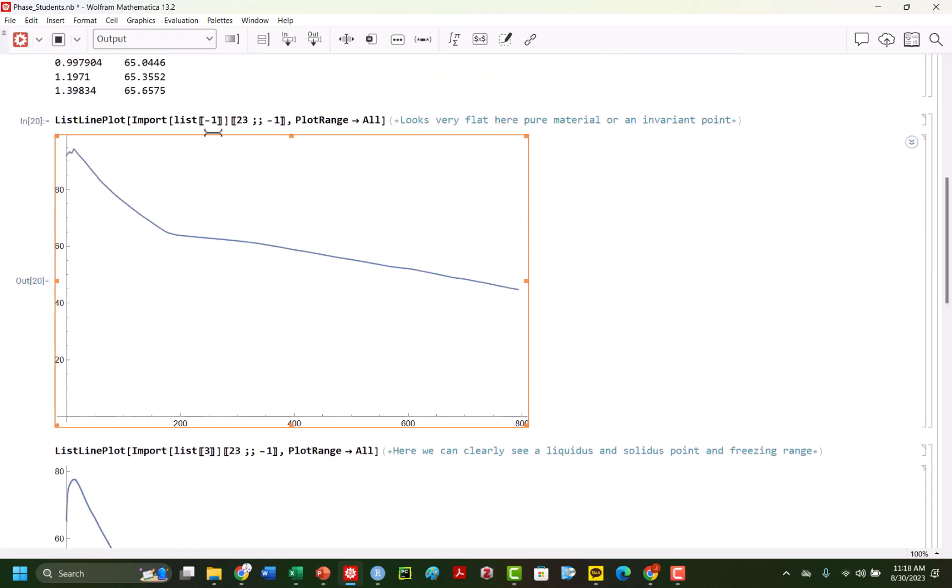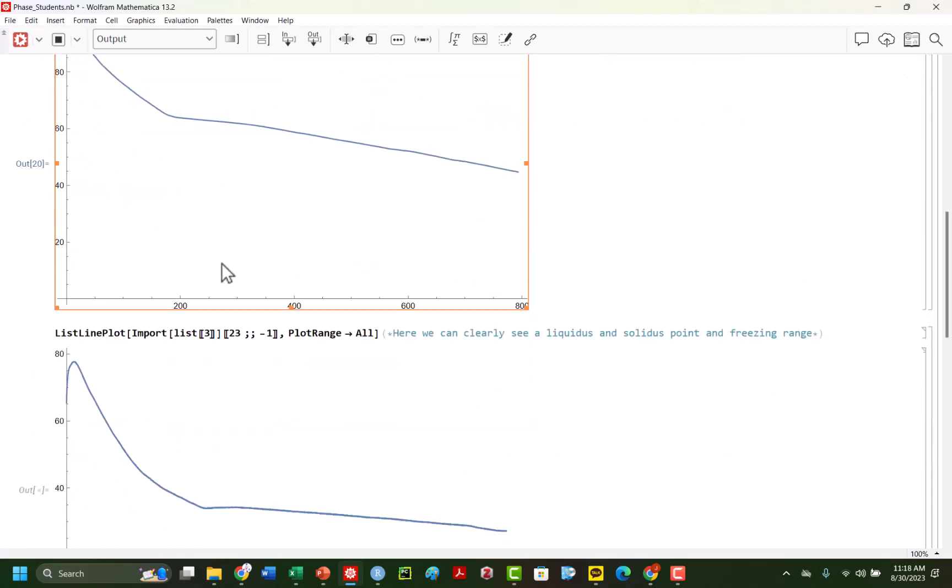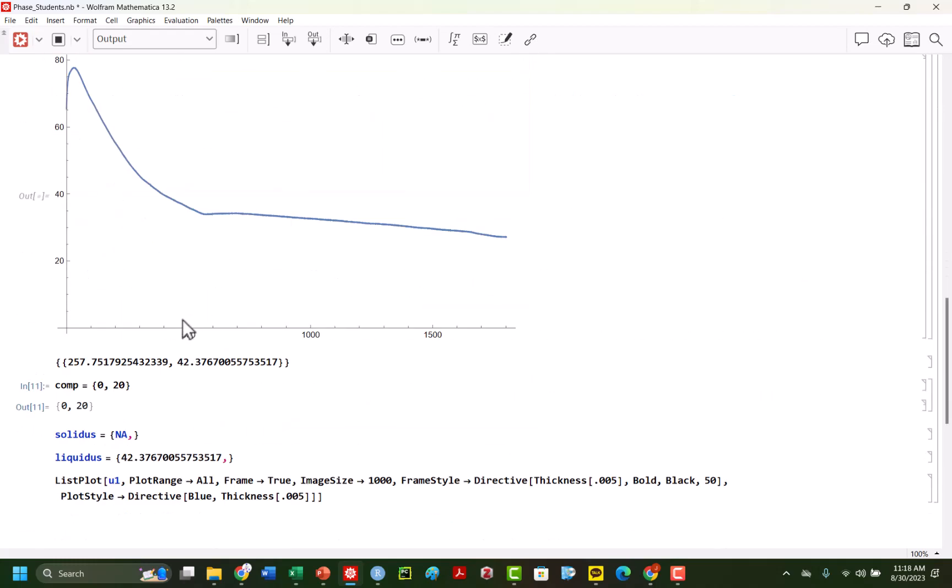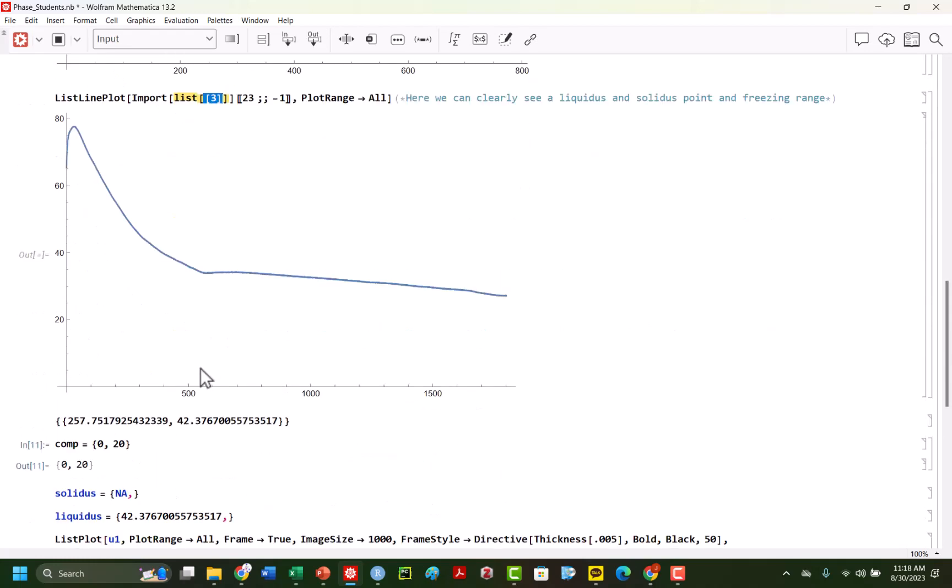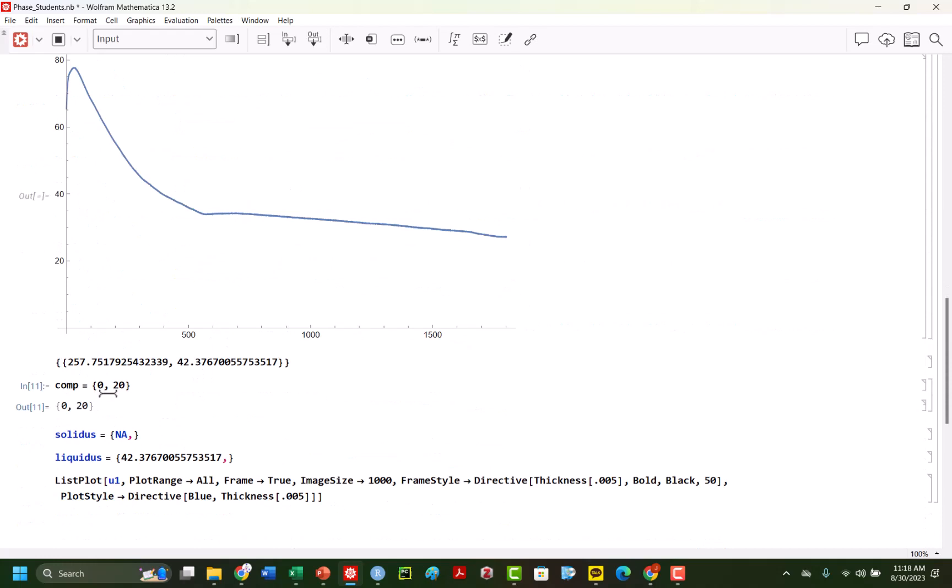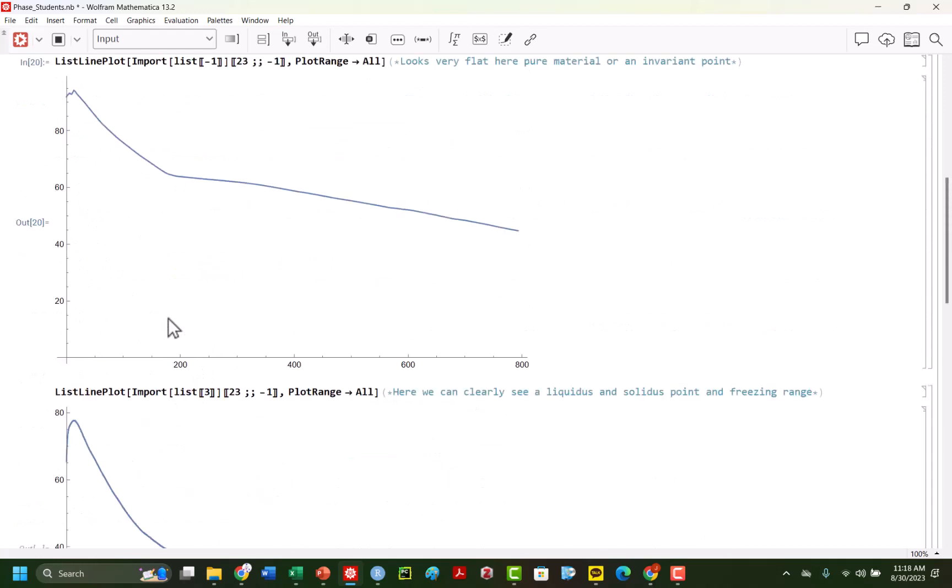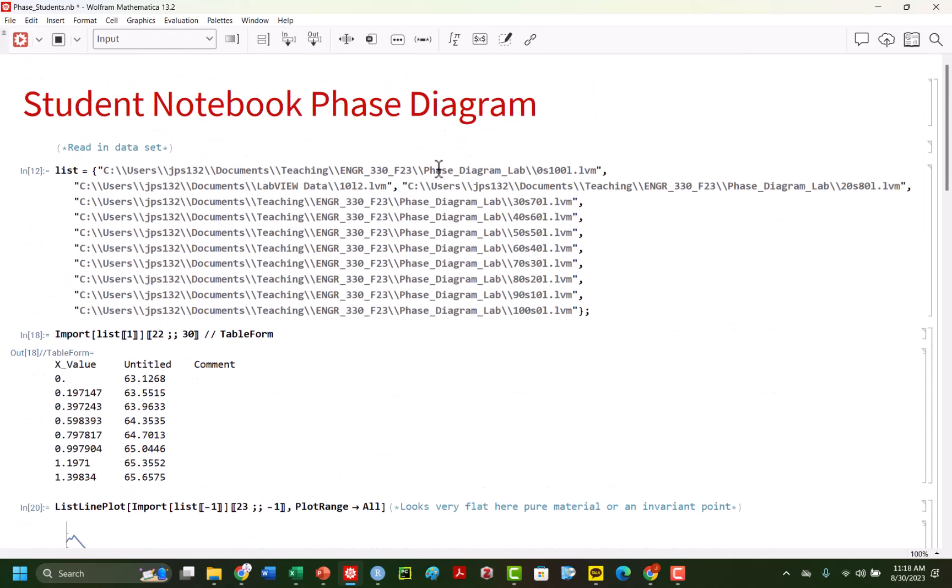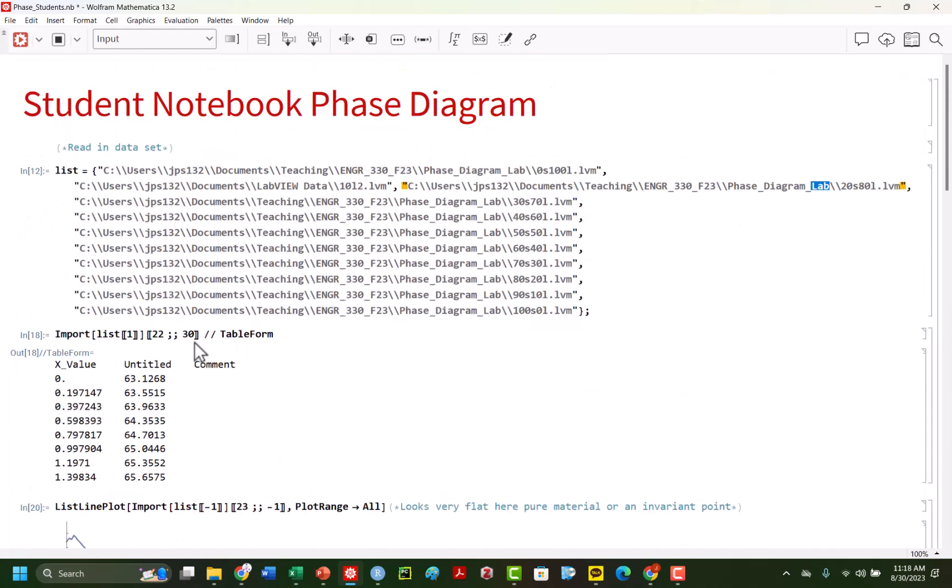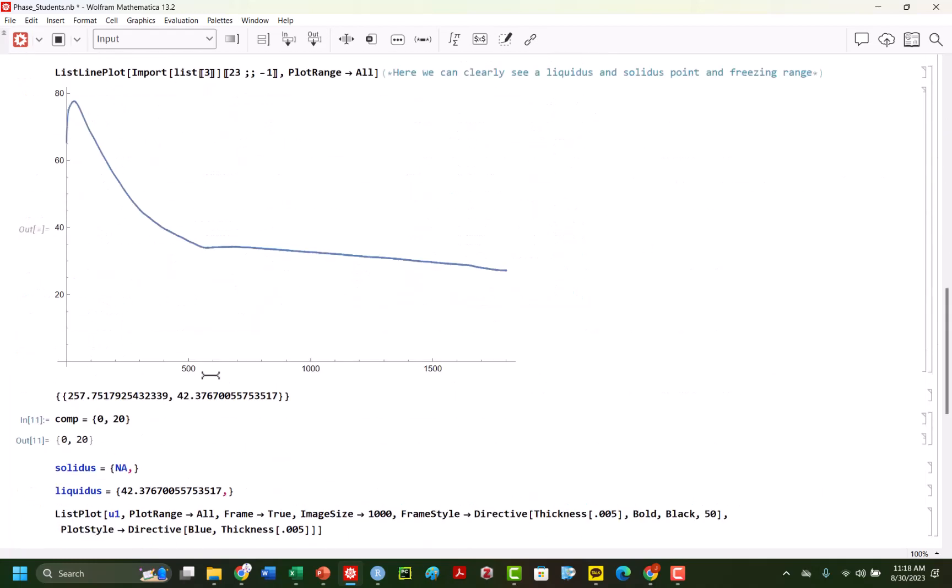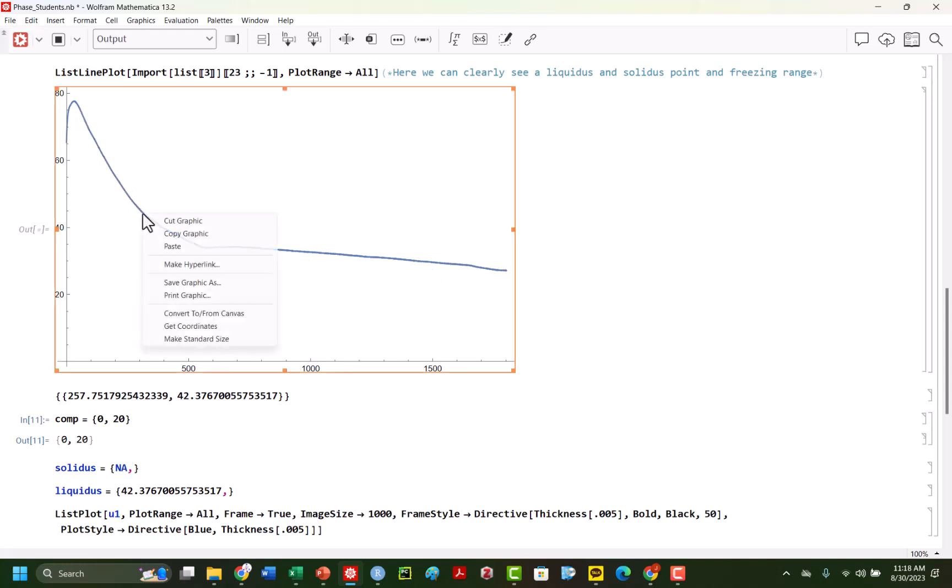for the pure materials, and then you'll have a surprise essentially for your invariant point. But here it's very, so for our third data set, which corresponds to our composition, again, you have 10 and then 20, 20% stearic. So this was 0% stearic. So we're increasing essentially stearic concentration. You see here, we have this period here. And now we have a clear change in slope for the freezing region here, and then that change to solid.